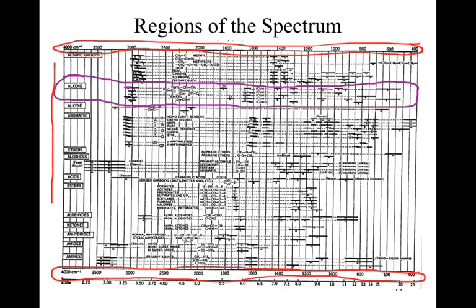So those two solid lines correspond to, if you zoom all the way in, you might be able to see this, a vinyl CH-CH2. Okay? So you would go through and try and interpret where you saw a signal and where does that match up. So it's a lot of back and forth. The real way is ultimately going to involve a lot of back and forth too, but this method was really, really tedious. So let's simplify this a little bit.